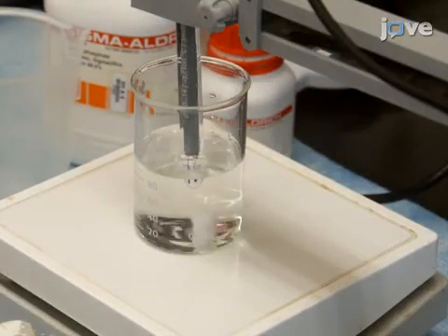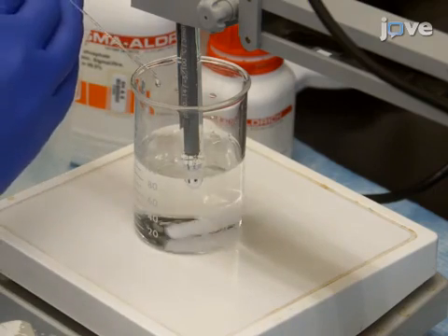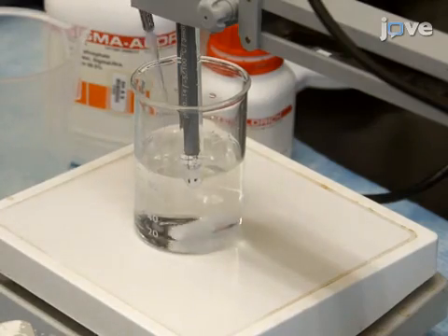This protocol begins with preparations of the glycan samples. The base solution for the glycans is a stock printing buffer, which, when made, should be slowly titrated to a pH of 8.5, and then given an addition of surfactant.